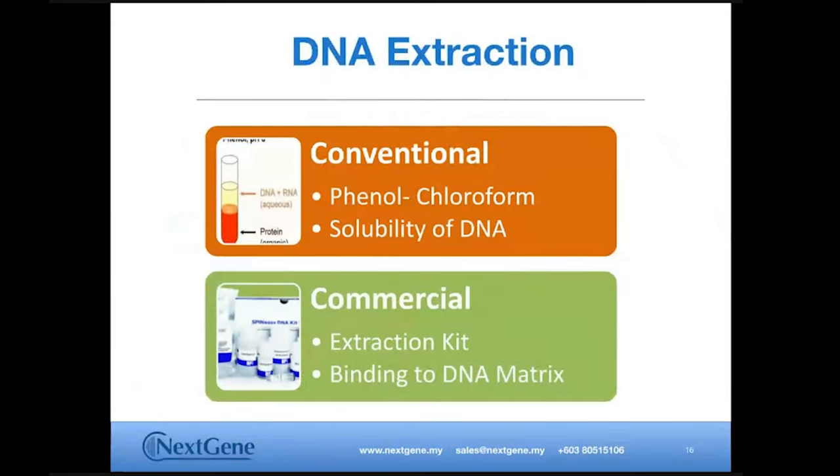Now, upon lysis of samples, let's look into the extraction methods that are commercially used. Here, I'd like to share two methods, namely the conventional as well as the commercial methods. The conventional method involves phenol chloroform. Chloroform alongside phenol separates between aqueous and organic solvent. The density of chloroform is higher compared to phenol and water, causing a separation of organic and aqueous phase. However, this skill is not easily operated and a very technical and skilled researcher is needed for this procedure. Also, chloroform is very toxic to humans.